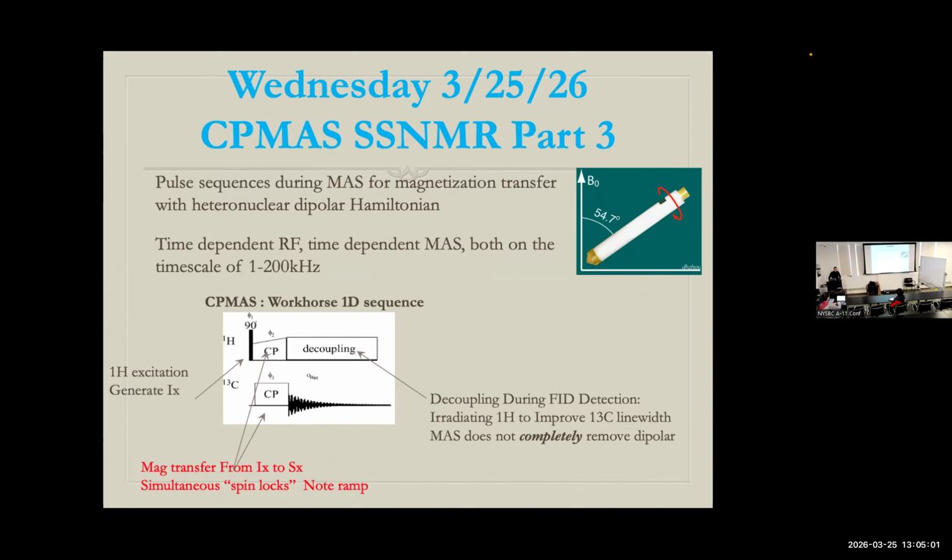So I thought we were doing MAS on our protons. So doesn't that decouple everything? Wasn't that the whole point of MAS? Well, it doesn't completely remove the homonuclear dipole couplings of the protons, a point that I will be returning to.